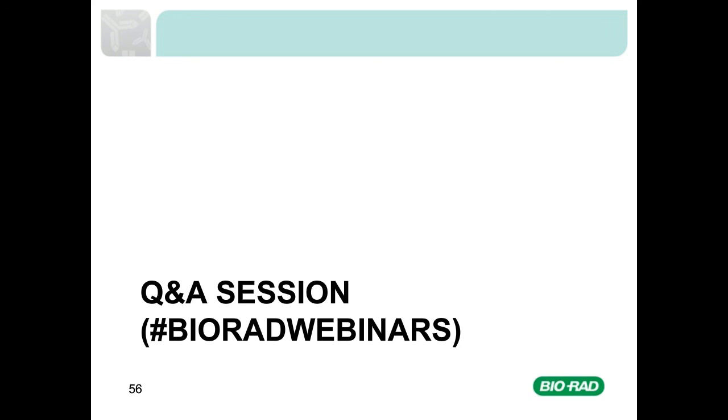The next question we have is, can you reuse a lysate for different targets? That's a very interesting question. Obviously, there are times when you have very precious samples and you might want to IP more than one antigen from the sample. So what we suggest is that providing you can get enough lysate recovered from the beads for another IP, you should be able to do this. You may need to add some more lysing buffer or recovery buffer to the IP beads with a subsequent decrease in concentration.